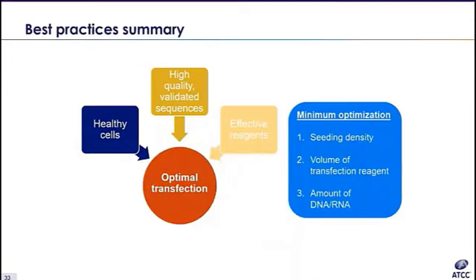And so this is the very last slide on transfection. I'm just going to summarize best practices for the transfection section of this talk. To achieve optimal transfection efficiency, use healthy cells in exponential growth, free of contamination, and DNA that is of high purity and endotoxin free, and the recommended lipid for each cell type and substrate should be determined. Every setup may require some optimization, including but not limited to seeding density of cells and the ratio of lipid to substrate.